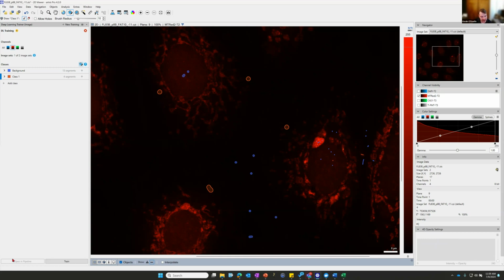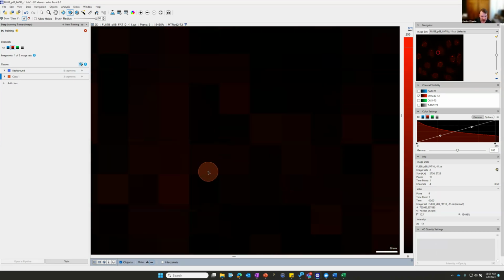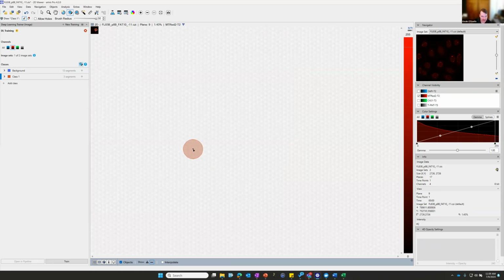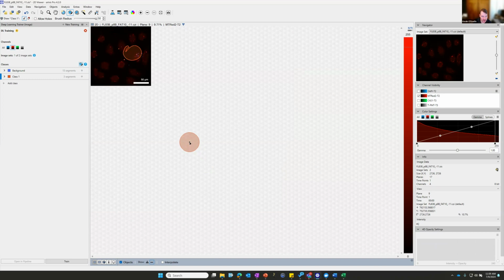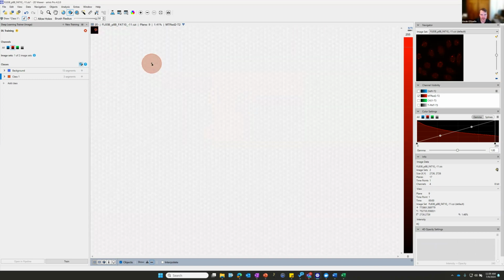And then once it is done in training, same thing with that machine learning trainer, you can then open up in a pipeline. Okay. You can change the brush radius here. And that would also scale based on the size that you are, or it wouldn't scale to the size of your viewer. It'll just be the static diameter, the static radius that will scale to the viewer here.